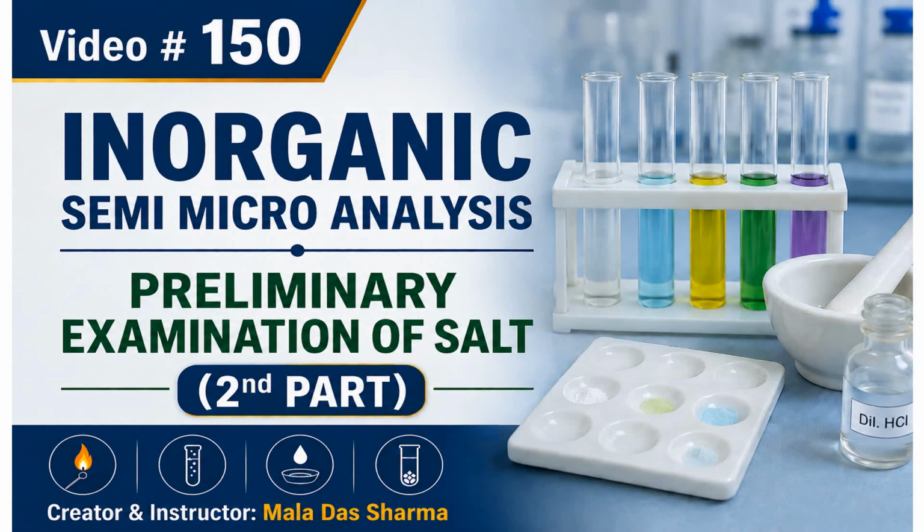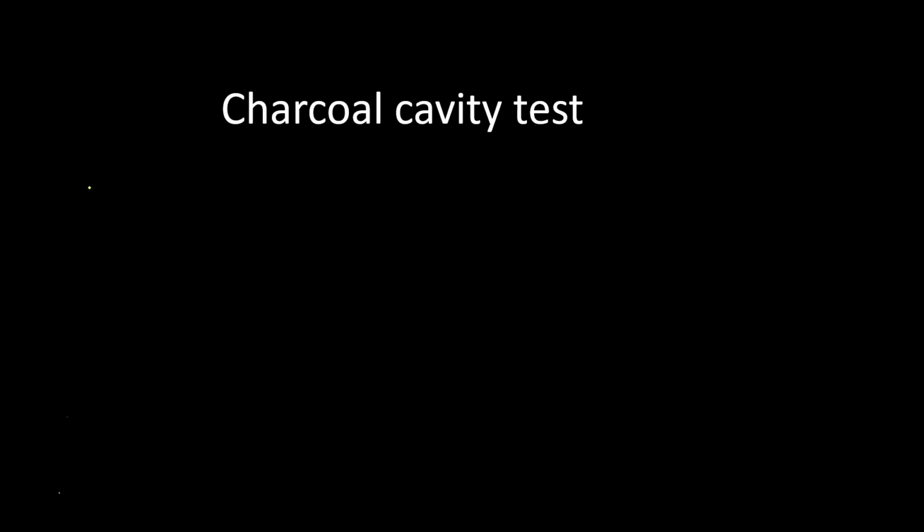Now I am doing the course on inorganic semi-micro analysis and today's topic is preliminary examination of the salt, second part. In the first part I have already discussed dry test tube heating, flame test and borax bead test. Today I am going to discuss the charcoal cavity test and fusion test for chromium and manganese. So let's start. Charcoal cavity test.